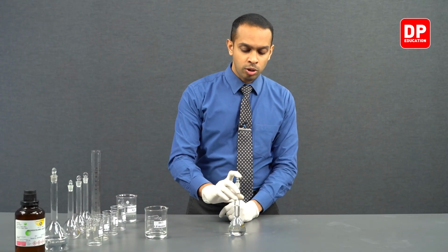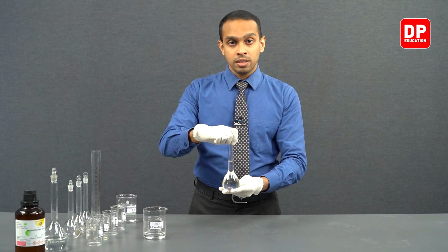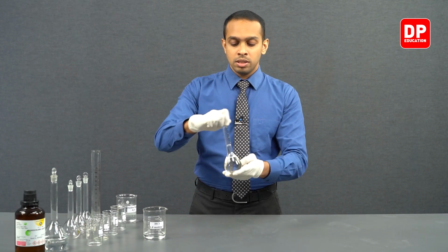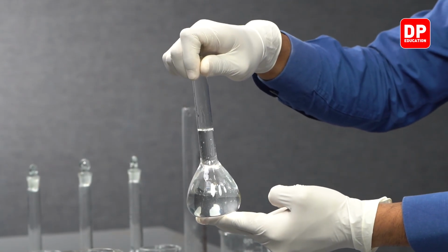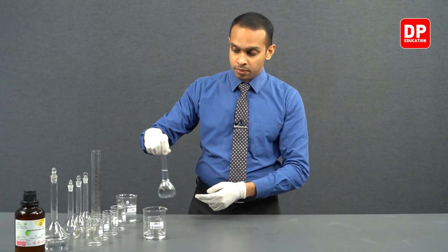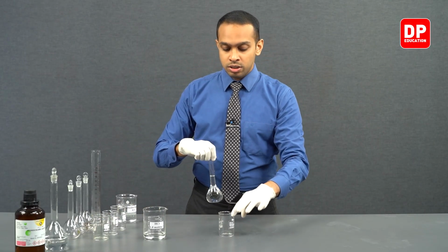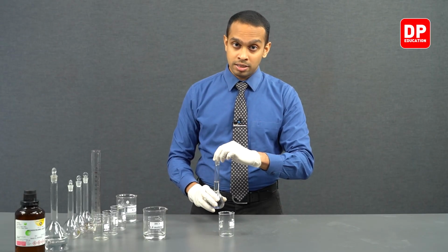Then we can place the stopper. After placing the stopper, turn this volumetric flask upside down a few times to make a homogeneous solution of HCl. And then students, we have prepared a 0.8 mole per decimeter cubed concentrated HCl solution.